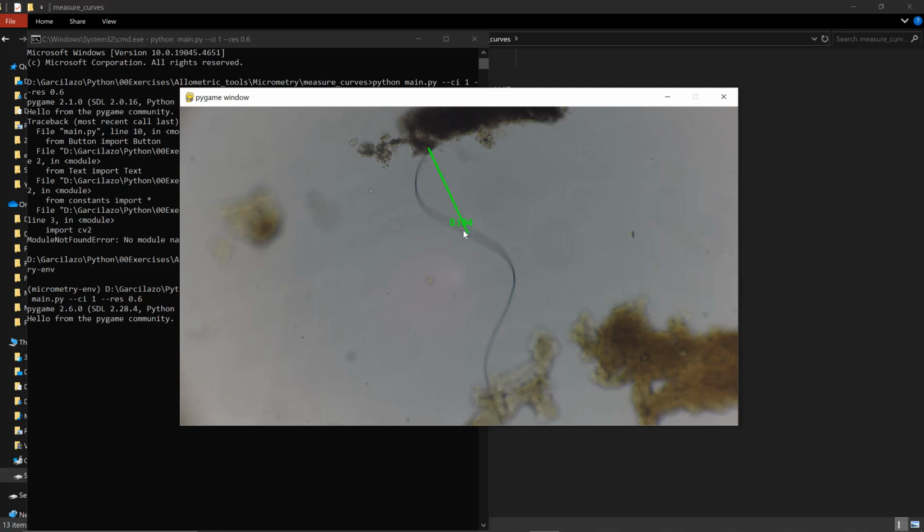I'm gonna go to the middle of the curvature at the inflection point when it starts going the other way. However, this time I don't release the mouse button. Instead, I keep dragging outwards, creating a counterpart line that ends with a dot, representing the point of gravity that is pulling the otherwise straight line away. And I can leave it right there to make sure that it matches the curvature of my object. Once I'm ready, I lift the left mouse button and I confirm my selection.